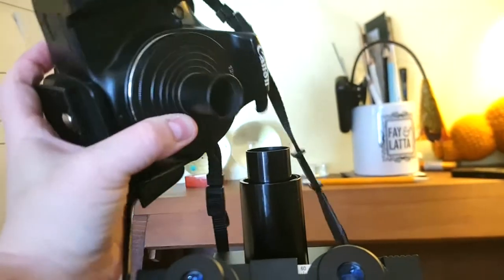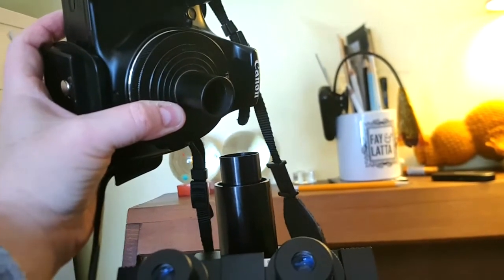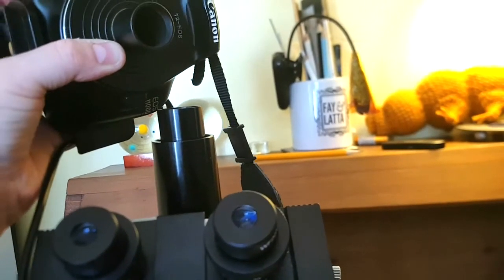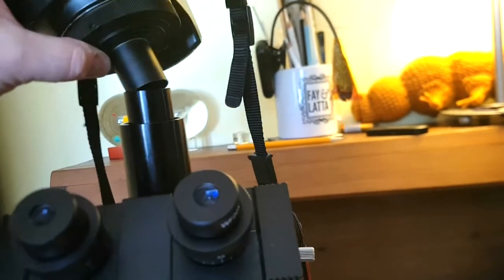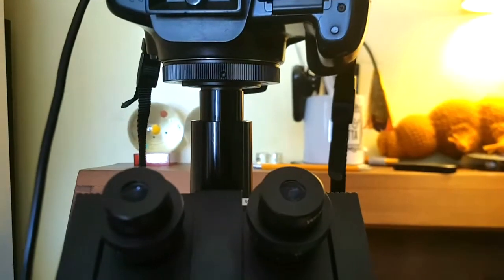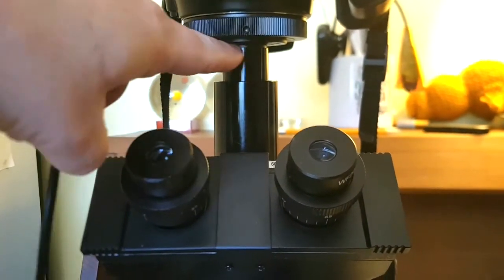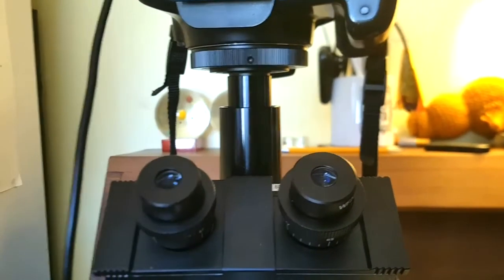So the camera is attached to the microscope using a T-ring, which is the same T-ring that you would use for astronomy photography and connecting your camera to the telescope. But instead of the nose piece being 1.25 inch to fit a telescope eyepiece, this one measures 20 millimeters or 2 centimeters. So you put that on and it will just sit in there. The nose cone of that T-ring assembly will unscrew, and you can then screw that straight into a CMOS camera. So our ASI 120 cameras will fit this. It's threaded the same way. So if you disconnect this extension tube, you can then attach the ASI camera to this microscope, which is fantastic.